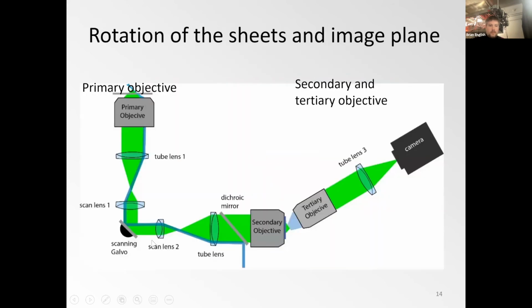So at first I would think, given that's the same scan lens, that these angles are similar, even though this adds to magnification. I don't think this space would help, but it's surely a point that one can consider.